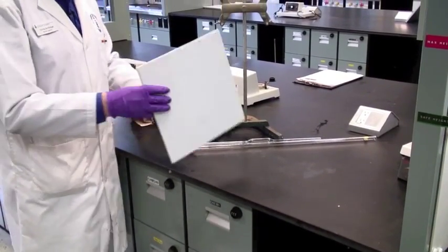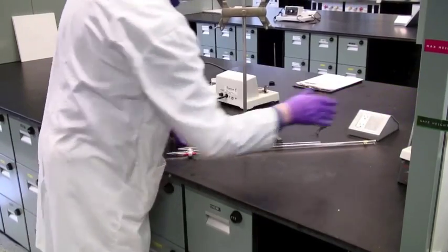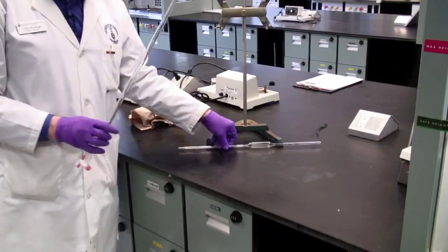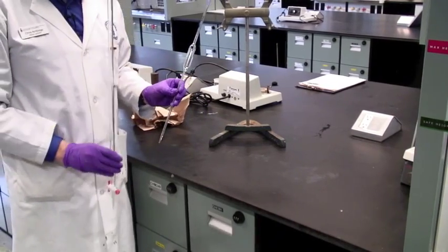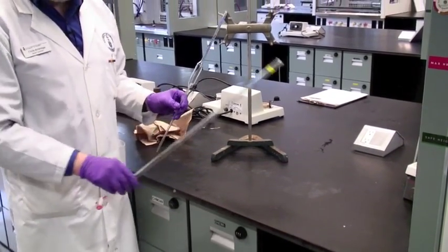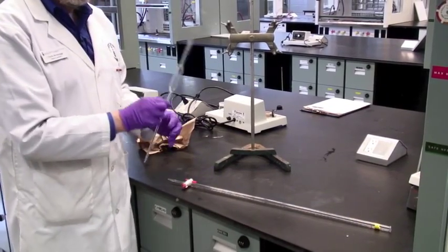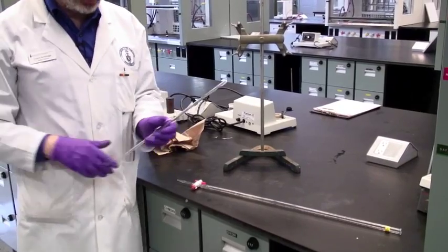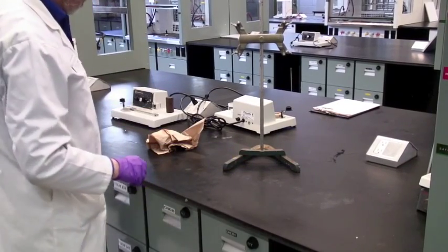The titration background leans up against the wall so it's out of somebody else's way. Burette and pipette need to go back. The burettes are over and against the corridor side wall. The large pipettes, that's the 25s, go back to your TA station, and we'll put those away.